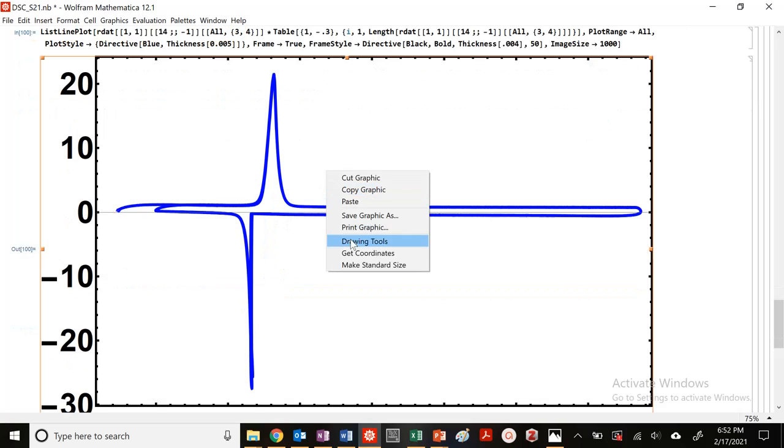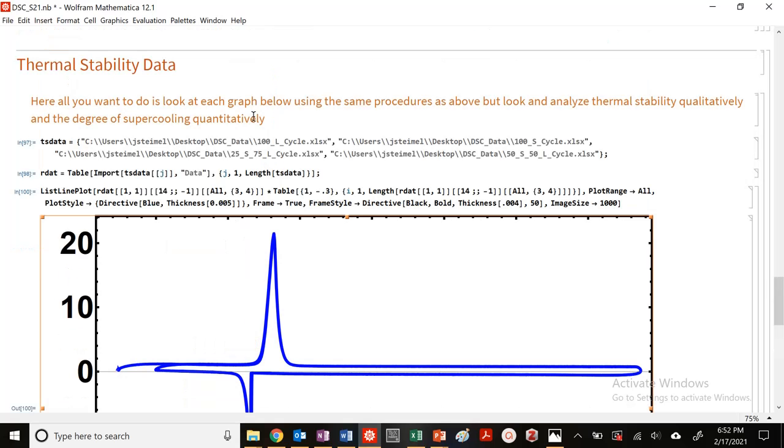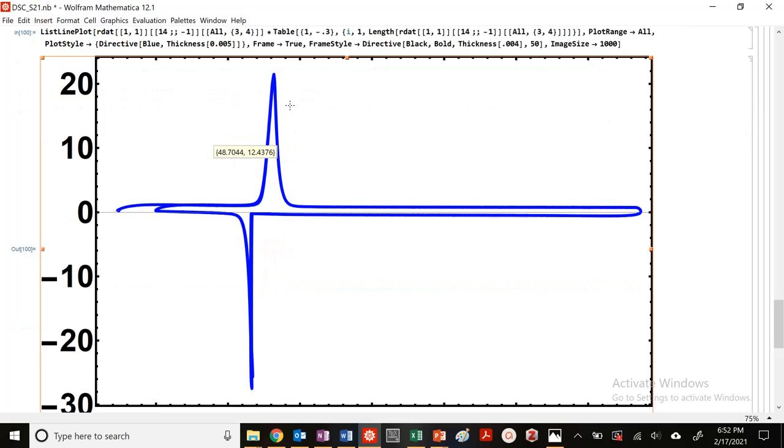The other property we see here, which is very weird, is that I melt at 46.5 degrees, but then I solidify at 43 degrees. This is weird, right? Like ice, I know ice should melt and solidify at 0 degrees C. There's only one melting temperature, and the solidification temperature is the same. So why is there this difference? Well, this is the degree of supercooling. The degree of supercooling is the difference between this peak right here, 46, minus this peak right here, 43. So why is there this 3-degree difference, this 3 degrees of supercooling?